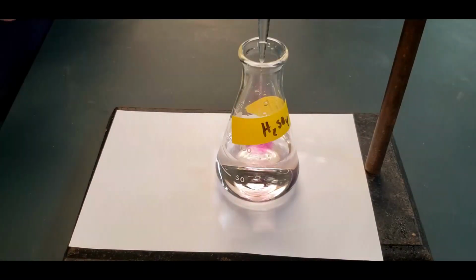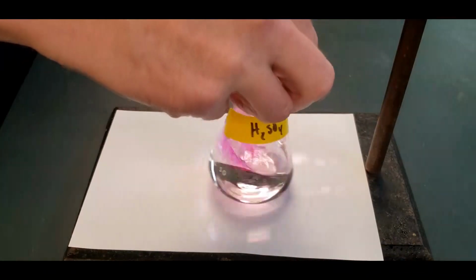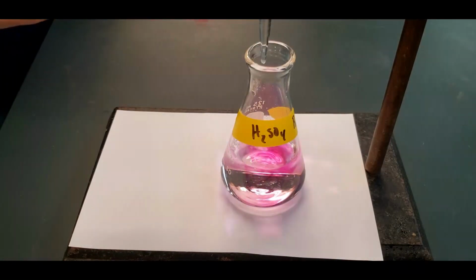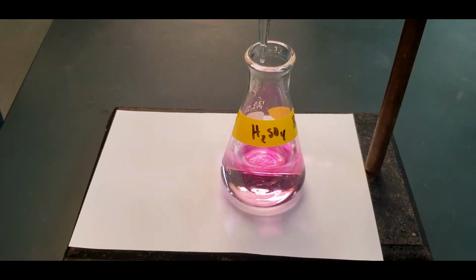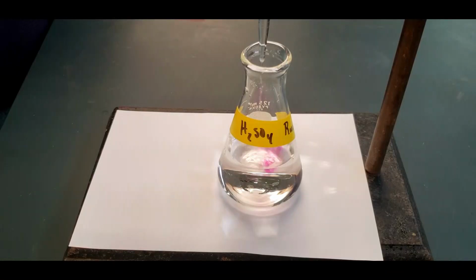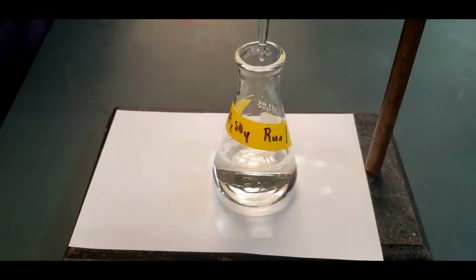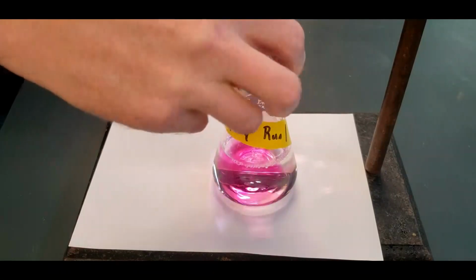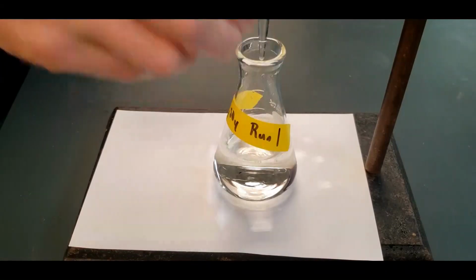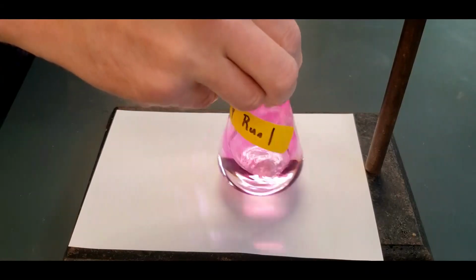You can see it shows up. Dissipates, shows up, I'll swirl it. I can make it dissipate by swirling. So, where are we here? Okay. Swirl, swirl. And so we must be getting near the end. There are a lot of different ways you can approach this. You can just do it drop by drop, or you can just put in some, and then, the fact that the color stayed around for so long shows that we're nearly there.